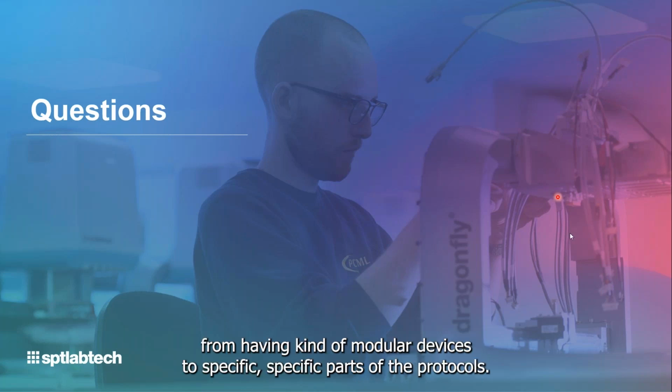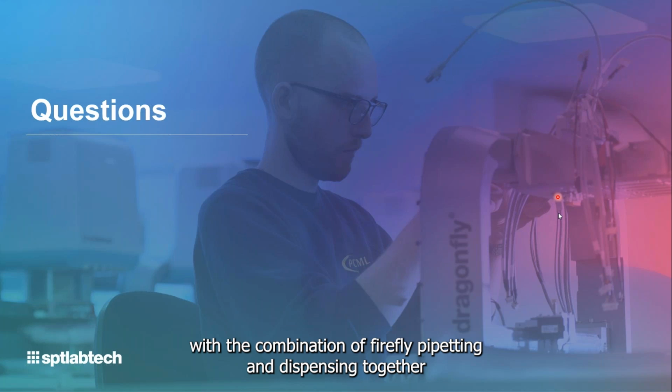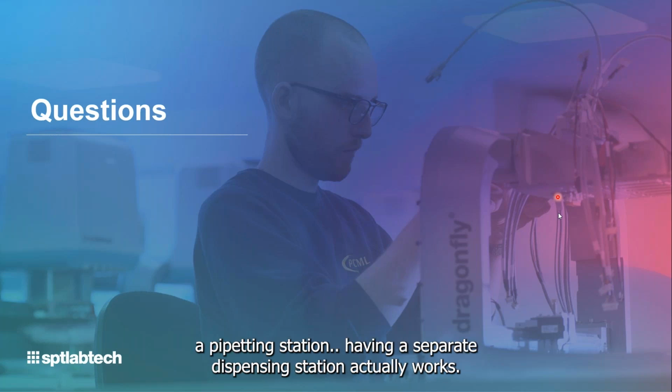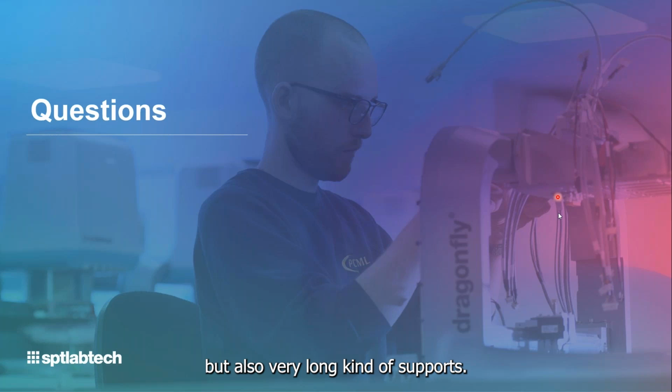It also depends on your workflow, because some workflows may work better with modular devices for specific parts of the protocol. You may find that a workflow is better with the combination on Firefly of pipetting and dispensing together and moving from one to the other seamlessly, or it may be that having a pipetting station and a separate dispensing station works better. So we're happy to work with you on your workflows and make recommendations on what would be the best option. That was a very long answer, but it's kind of yes and no. It may be, and it also may not be, for the reasons I said.